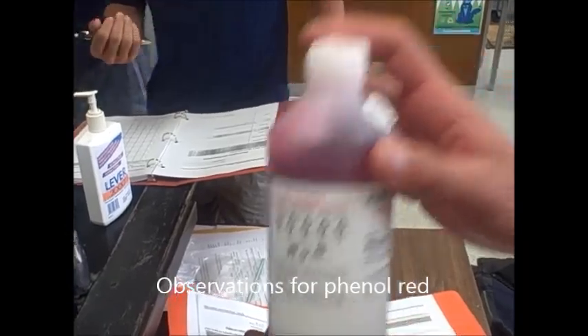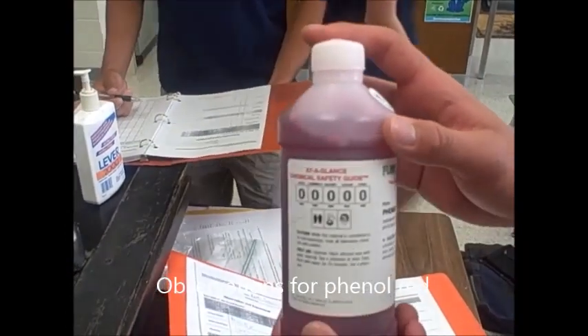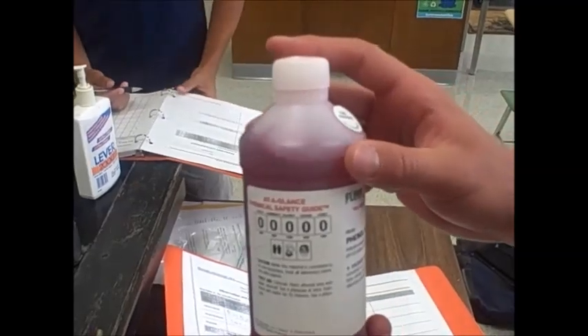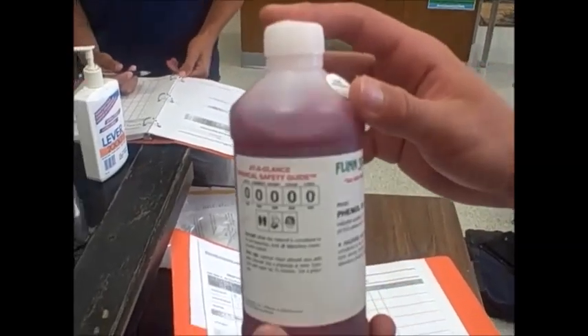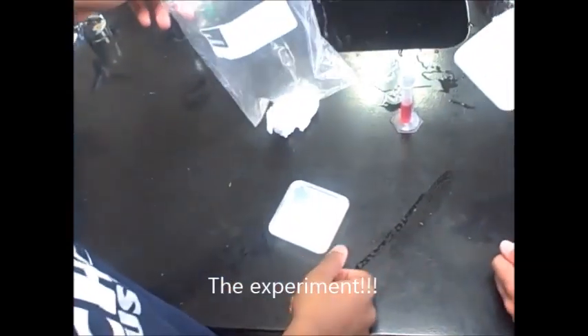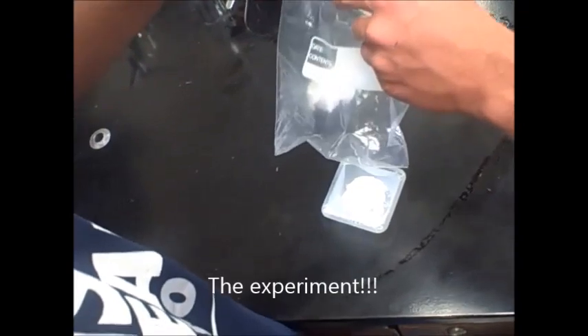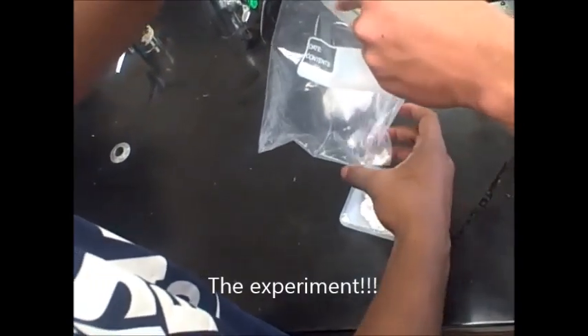It feels thick almost, like I'm shaking around, and it feels thicker than water. Okay, and that's red. This is a calcium chloride, I'm going to put it in the right corner. And this is sodium bicarbonate, and then the left one.